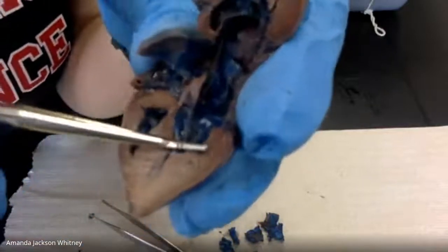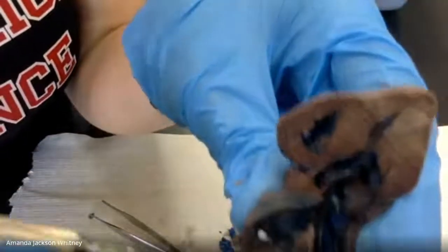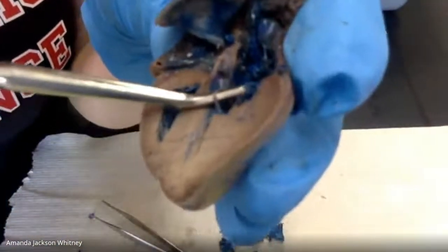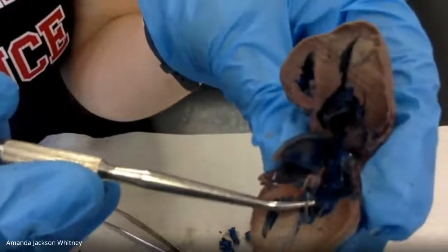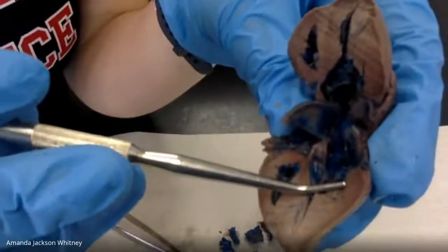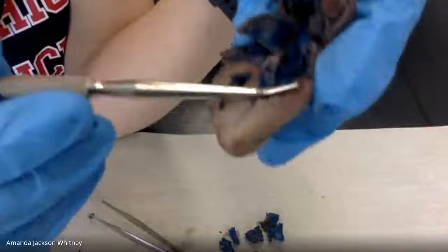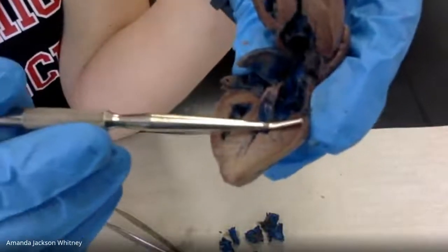Sorry, if I'm too low, please tell me, guys. Can you see these little string thingies? Mm-hmm. So, do you remember what those are called? Capil. It starts with a C. It does start with a C. Capillaries. They're not capillaries. Capillaries are the blood vessels that are the tiniest of all of the vessels.